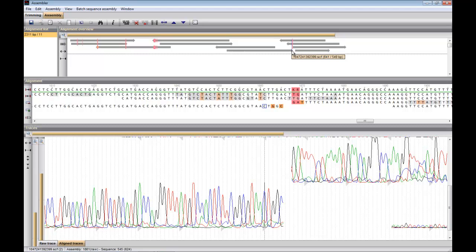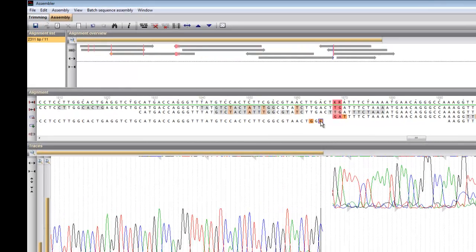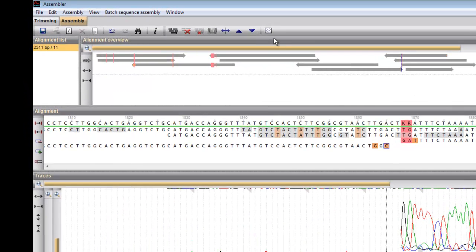The order of appearance of the trace file can be changed by clicking on a trace and using the page up, page down keys or the corresponding arrow buttons.